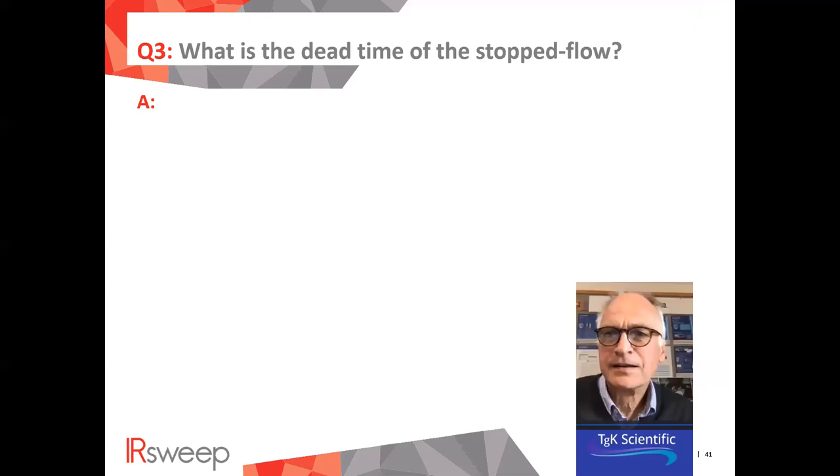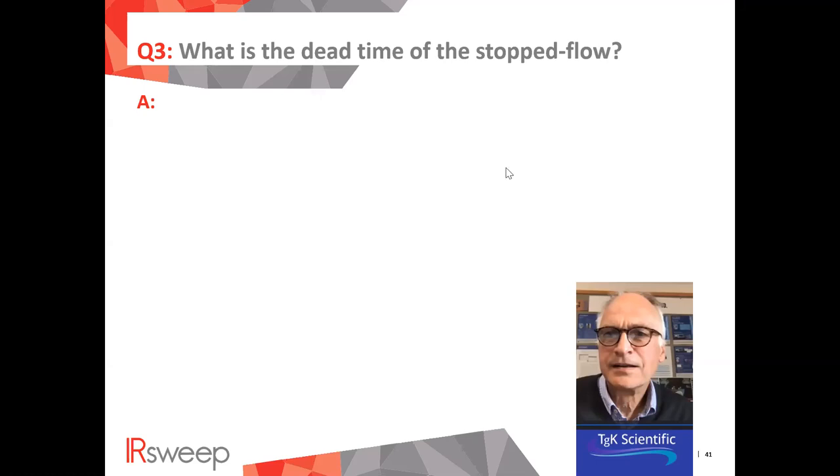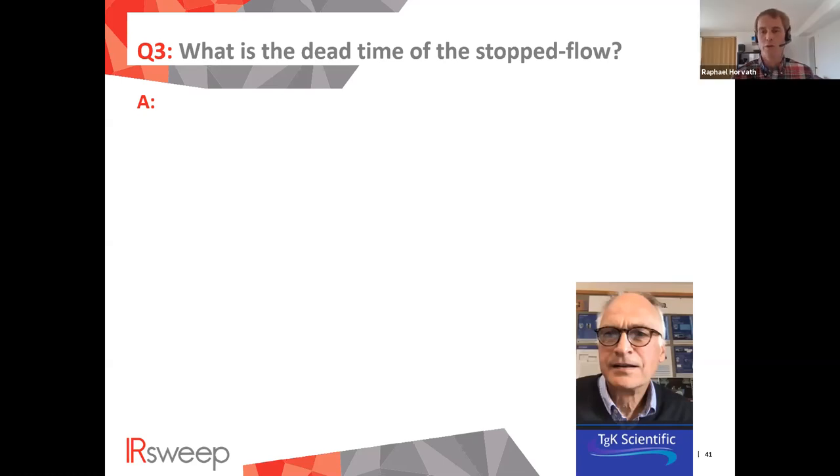Yeah, we showed a lot. Continuously, 220 spectra per second is possible. Rafael, can you elaborate a little bit more? You mentioned it before, but where does this go actually? I think we can do even much more than that. Well, if you're willing to go for only 100 or 200 milliseconds, you can go very fast. You can go to the 4 microseconds that I mentioned before. And actually I was a bit surprised at this. The stopped flow equipment is reasonably reproducible, so you can average as well. If you want to go to very short timescales with weaker signals, you can keep averaging and really get the signal to noise up. So at this point, how fast you can mix it is the limiting factor. Okay, very nice. So you would say the spectroscopy is not limited at all anymore, so you can really go very fast. I hope not. No. Okay.